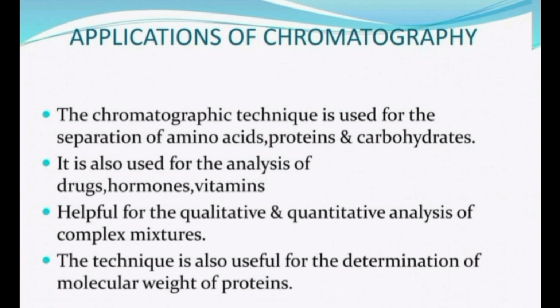Second, it is also used for the analysis of drugs, hormones and vitamins. Third, it is helpful for the qualitative and quantitative analysis of complex mixtures. Qualitative means what is present and quantitative means how much of the mixture is present in the system. Last, the technique is also useful for the determination of the molecular weight of proteins.